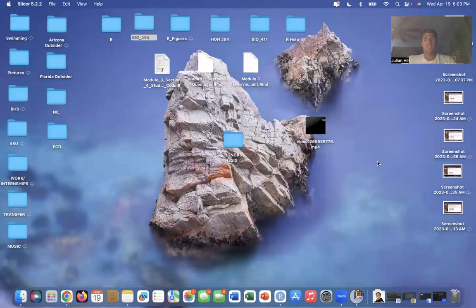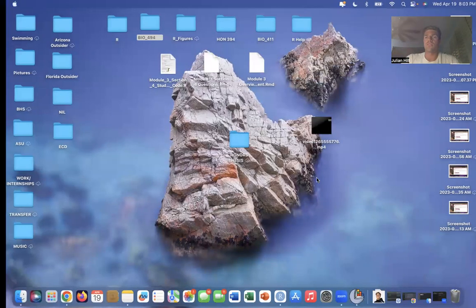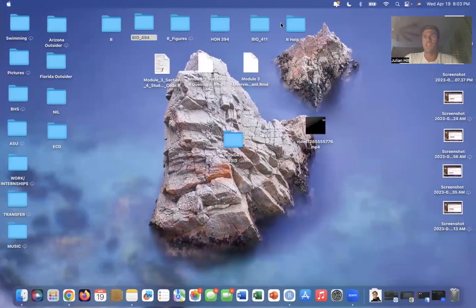I recommend doing them all individually, closing the app out every time and then reopening. It's a little bit of a hassle, but I think it's the best way to do it, and it helps keep things very organized. I also recommend having a single export folder. Once you've done all the measurements, they're in a single folder, and then you can refer to that folder when filling out the Google Sheet or whatever else you need to use the data for.